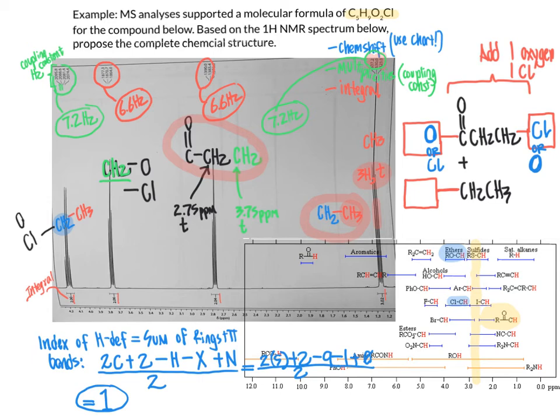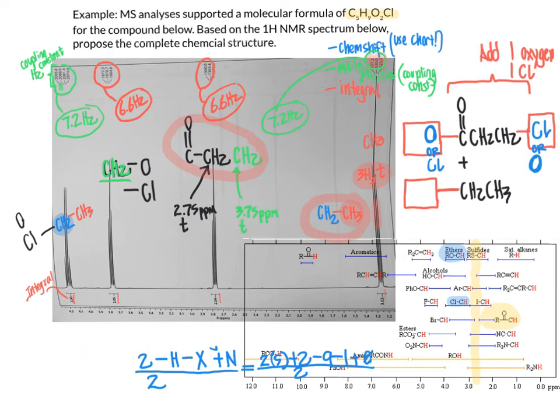One of those 2 possibilities has to be the right way, and then onward from there, we would connect to the CH2, CH3 group. And so thinking about which of those is the right way, we can draw out the 2 possible structures that we would generate from this. I'm going to draw those down here in the lower left-hand corner. And we're doing this process of elimination, this trial and error business here.